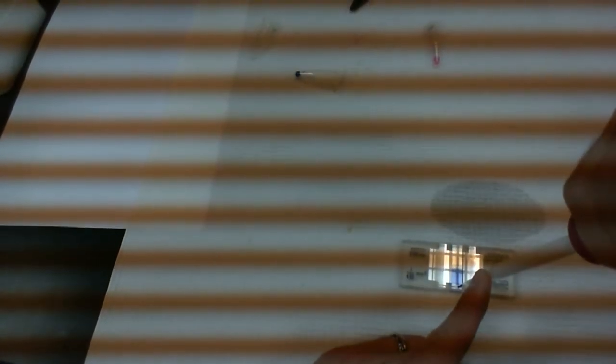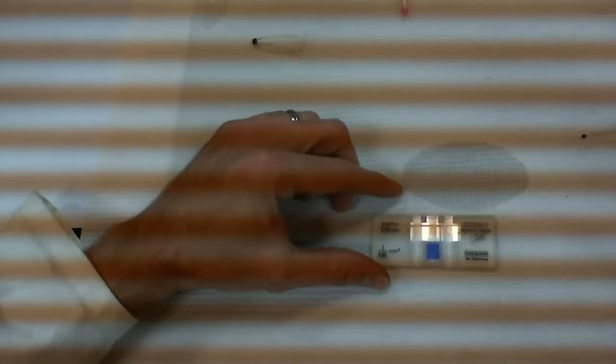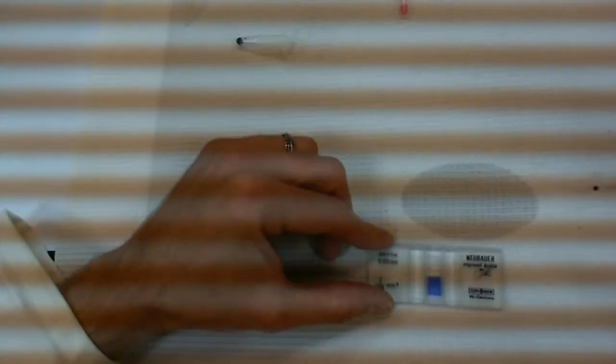And the fact that we have a well-placed cover slip is going to allow for capillary action to take place. There it goes. So again, I'm not trying to put things under the cover slip, I'm not trying to inject anything. I'm putting the drop of liquid next to the cover slip and it's just sucking it up. I'm going to keep adding until this point here. At this point, my counting chamber is filled, so I'm not going to add any more.